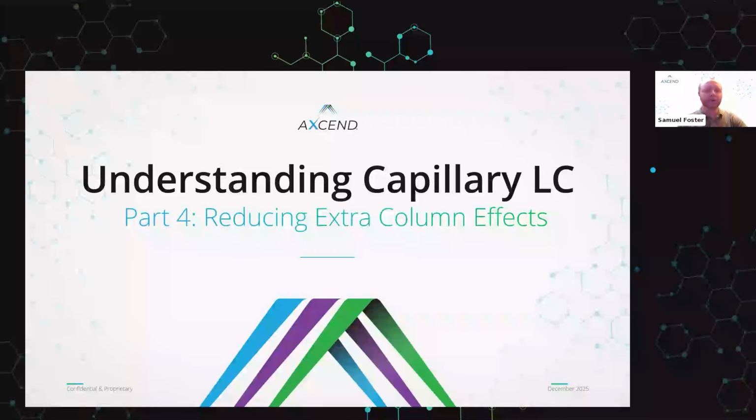For today, we're going to be talking about ways to reduce extra column effects and really talking about why that is so important when working on the capillary scale.